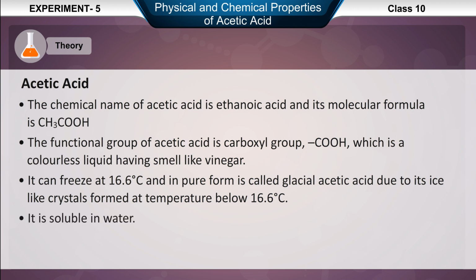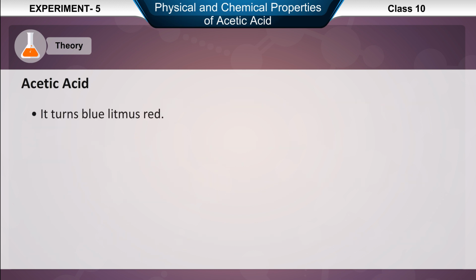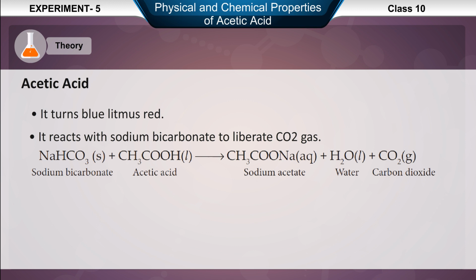It is soluble in water. It dissociates in water to form CH3COO- and H+ ions. The dissociation is partial and therefore it is a weak acid. It turns blue litmus red. It reacts with sodium bicarbonate to liberate CO2 gas.